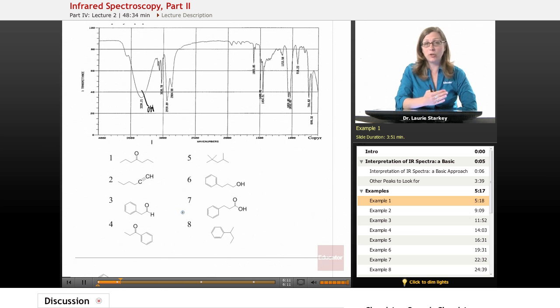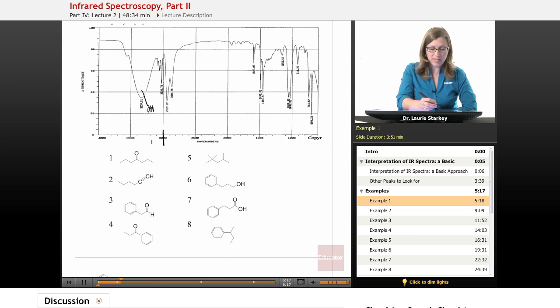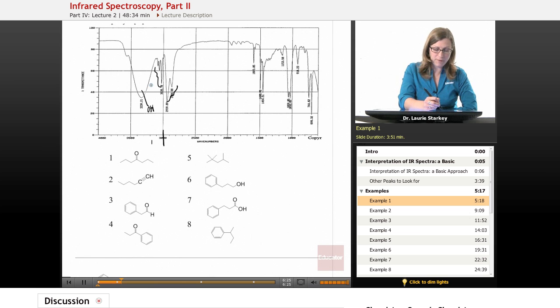We continue reading left to right and move to the 3000 mark. We look just above 3000 for peaks, and sure enough we see some peaks here. We also see some peaks just below 3000. Just above 3000 is where we find SP2 CHs, and just below 3000 is where we find SP3 CHs.